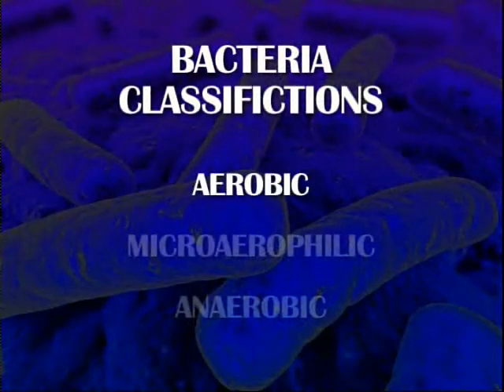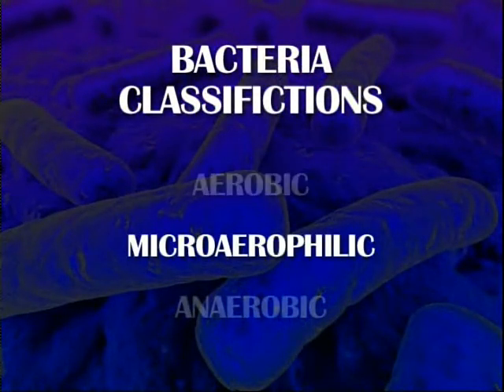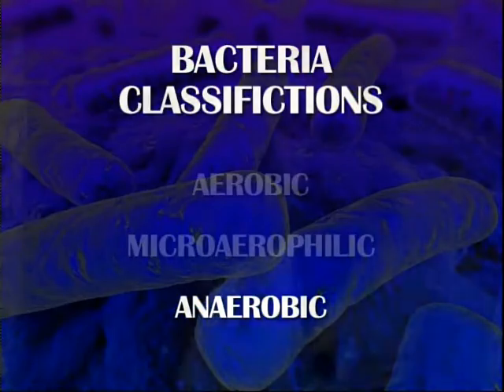Lastly, I want to address the atmospheric conditions required for bacteria to grow. Bacteria will either be classified as aerobic, microaerophilic, or anaerobic. The aerobic and microaerophilic bacteria will all grow in a CO2 incubator.